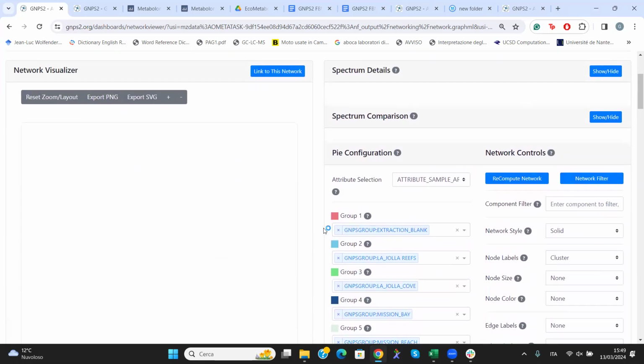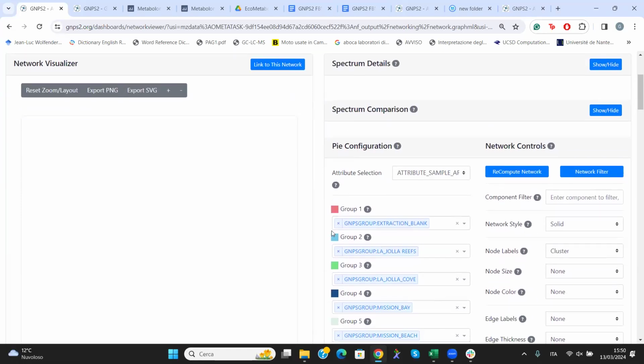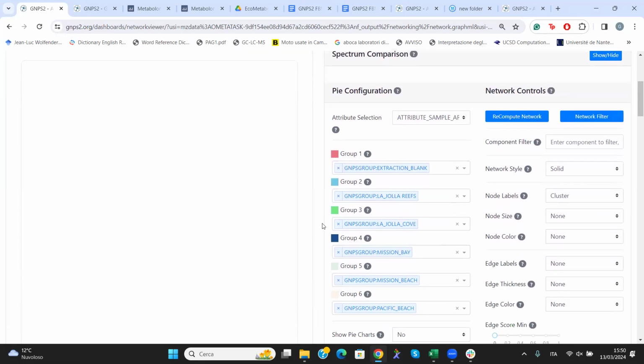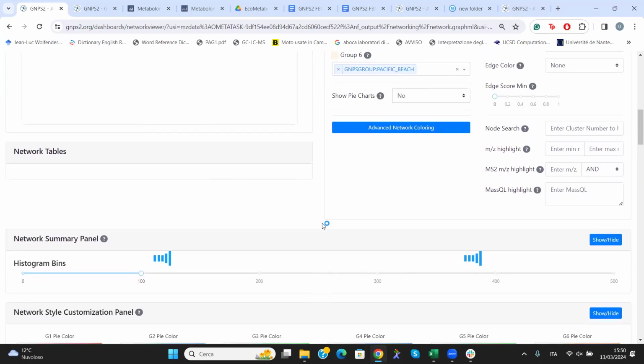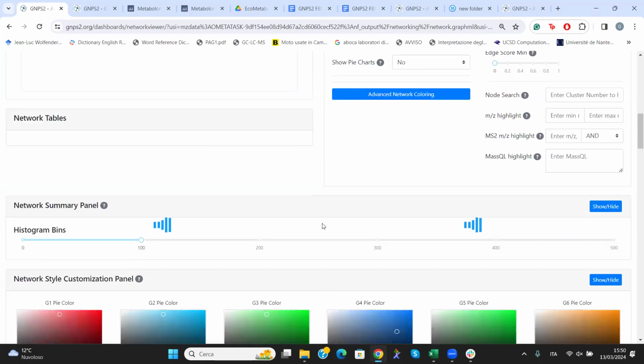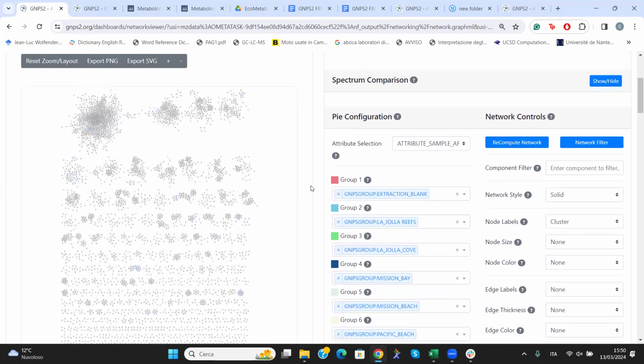In a minute our network should pop up. Does someone have a faster PC? It takes a bit. That's a good test, huh? Okay, I have it. Great.